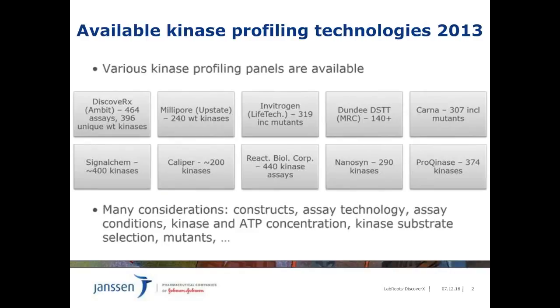At the beginning of the kinase inhibitor broad profiling project, we had to answer two key questions. The first question was which compound profiling platform to select. There are a number of possibilities here which are outlined in this slide. They differ by the number of kinases covered, the assay type format, cell-based versus biochemical, the construct type, or the ATP concentration used in the assay. So we selected the DiscoverX KinomeScan platform, which has broad coverage, including mutants.